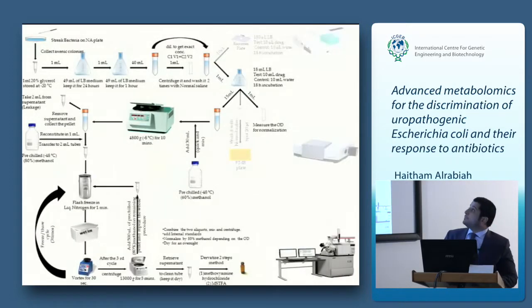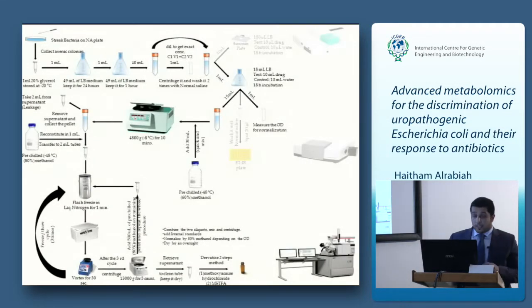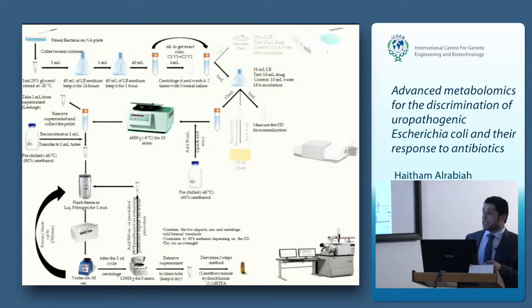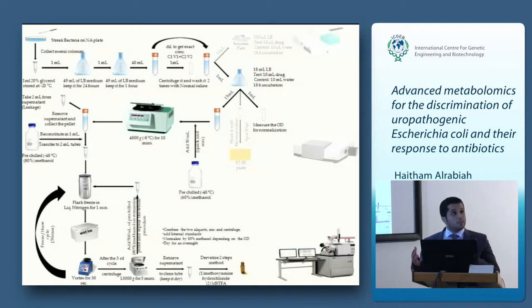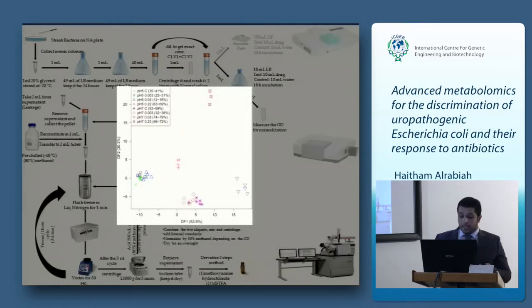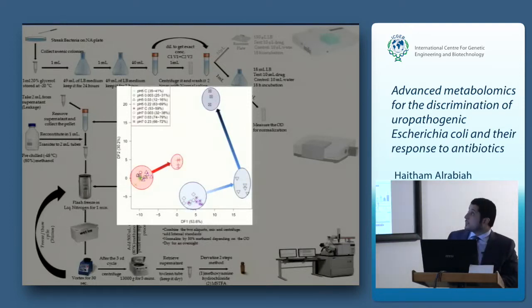So we further analyzed samples using GCMS, trying to investigate this variation between FTIR samples, which might reflect a phenotypic effect, and also to produce a metabolic profile of each condition, which might help us further understand the drug action on E. coli when it's incubated in conditions with a pH level similar to urine. Samples for GCMS were subjected to multivariate data analysis after data pre-processing. And here is the BCDFA, and samples were distributed similarly to the FTIR results.